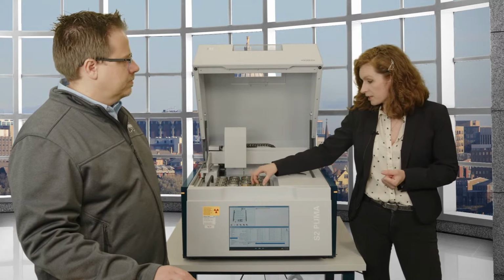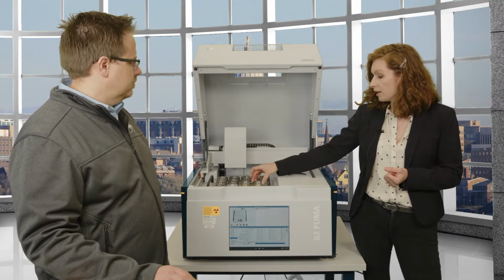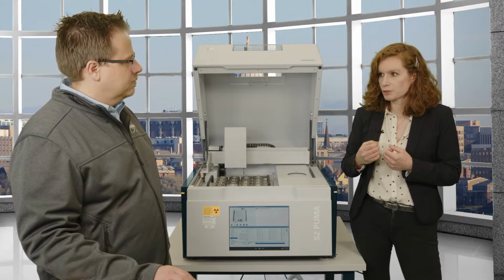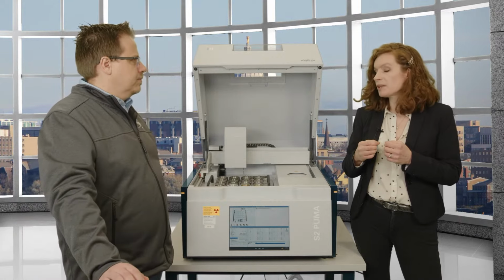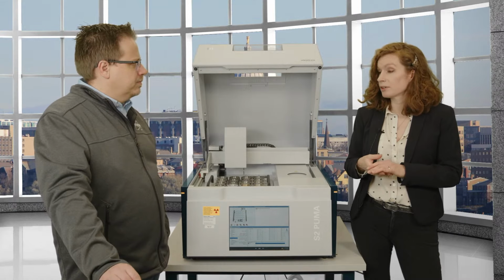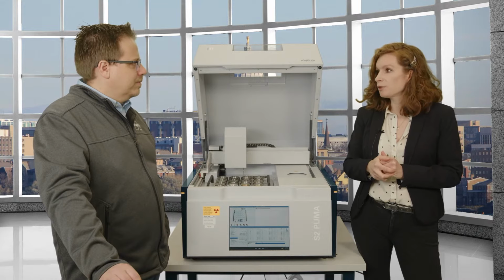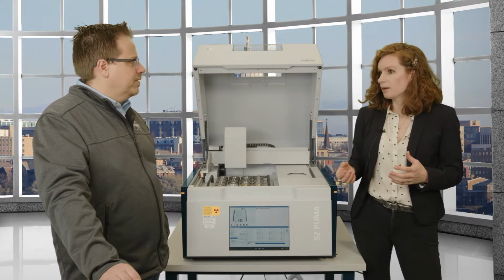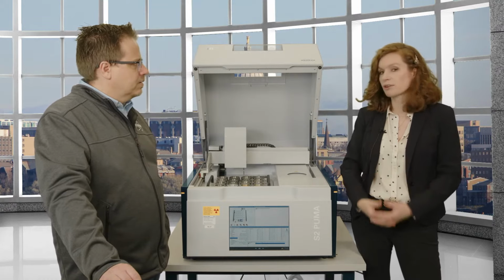But here we can measure larger sizes. This one is a 28 millimeter size. We can measure 34 millimeters. So it depends on what you want to measure. If you want to measure surfaces and very small, intricate parts, maybe not. Maybe an XRF mapping system would be great. Or if you want to measure at the nano level, then yes, stick to your SEM. If you want to know what kind of overall material you have that you later want to investigate the structure of, then yes, an XRF system would be great.